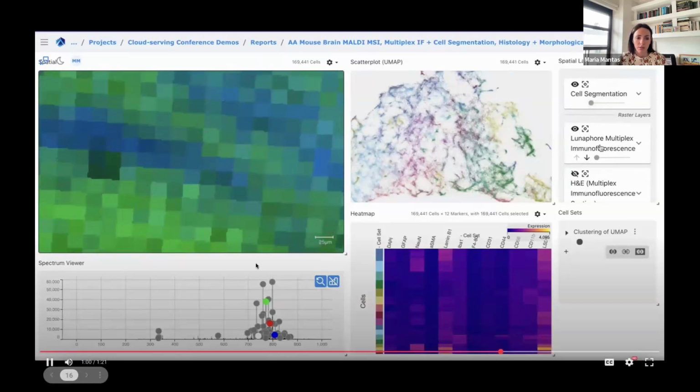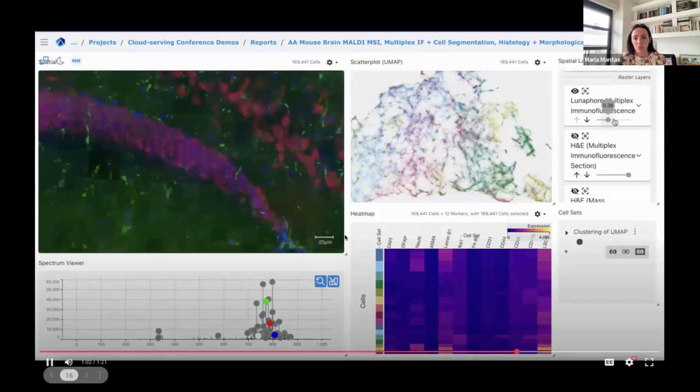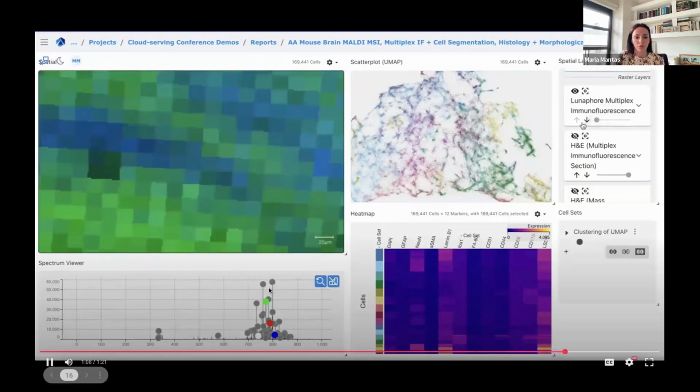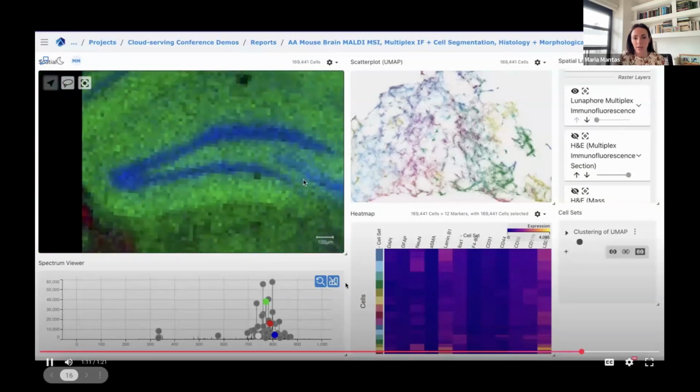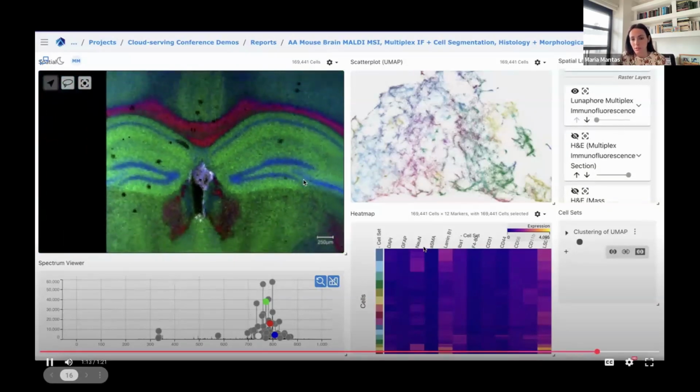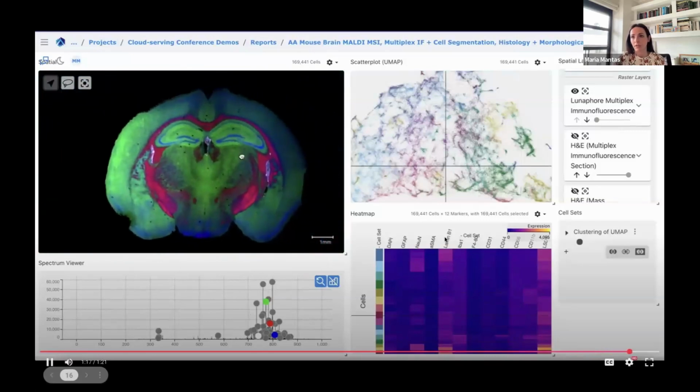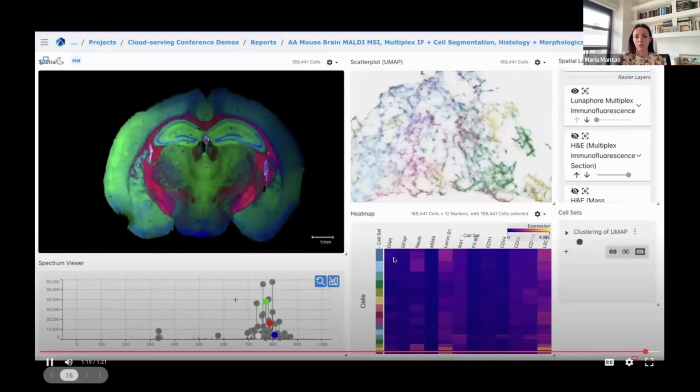With the platform, you can see also that there are adjacent widgets that you can use for downstream analysis and visualization, from choosing peaks or intervals of peaks in your MSI spectra to also different cell types based on biomarkers and also clustering.